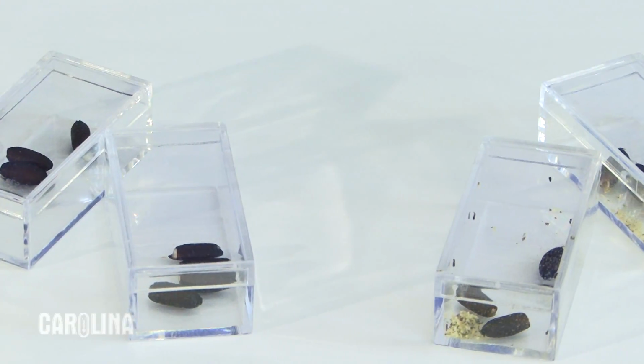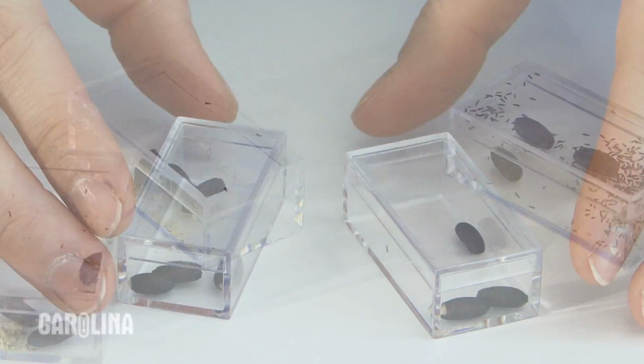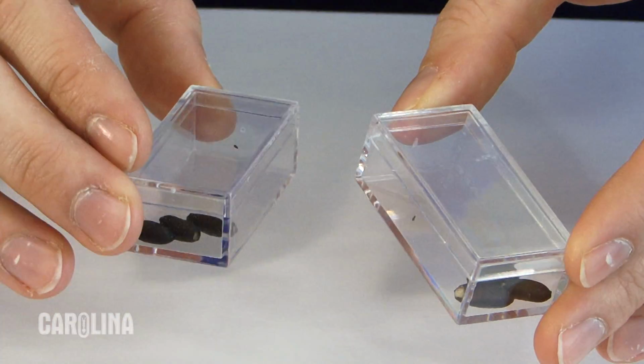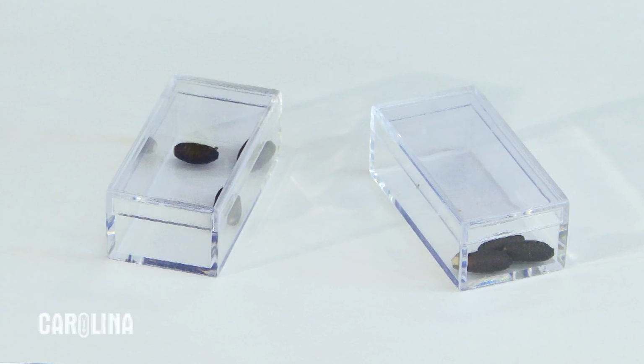When you receive your WOWBugs, they may be in various stages of development. If you receive your WOWBugs and only 3 or 4 adults are visible, you are viewing the females that laid eggs on the blowfly pupa. The WOWBug larvae will grow and develop within the blowfly pupa. In this case, set your culture aside and check daily for any change. The next stage you'll observe is the WOWBug pupae spilling from the opening of the blowfly pupa.